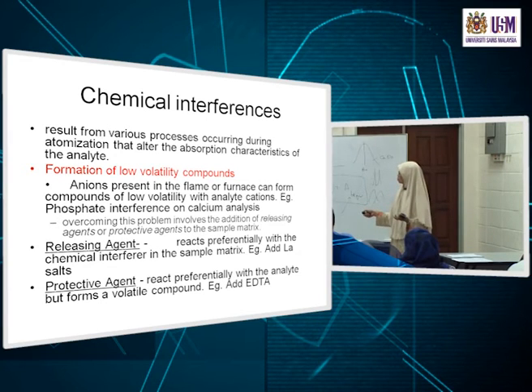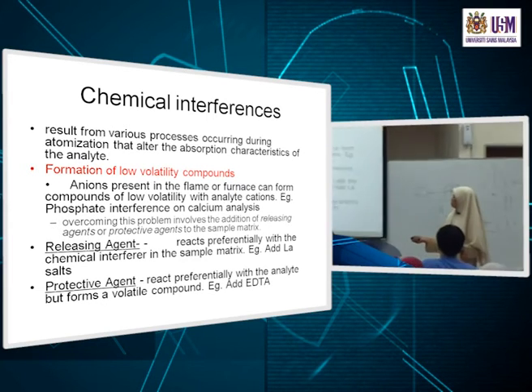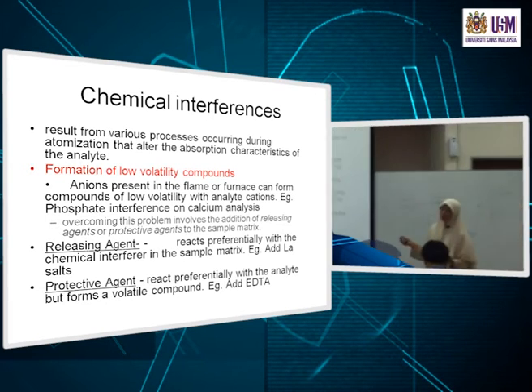So when you add it to your solution, it will complex your calcium and doesn't give the chance for the phosphate to complex the calcium. But a good thing about the calcium EDTA complex is that it is volatile. Even so, you are protecting your calcium. That's why the name is protective agent. So protective agents and releasing agents work differently, but all for the purpose of overcoming this problem.